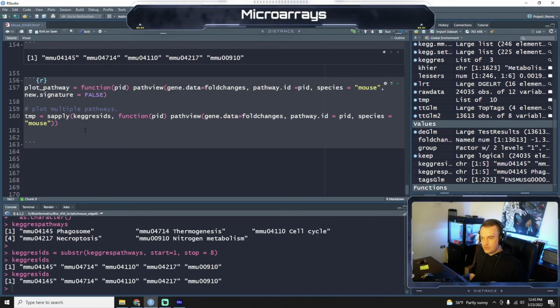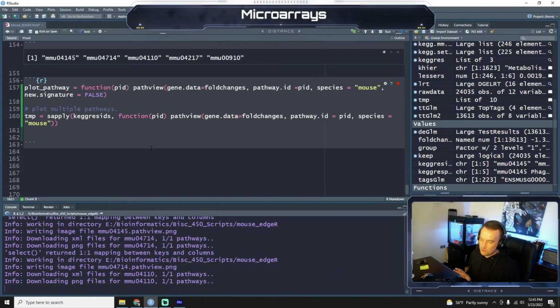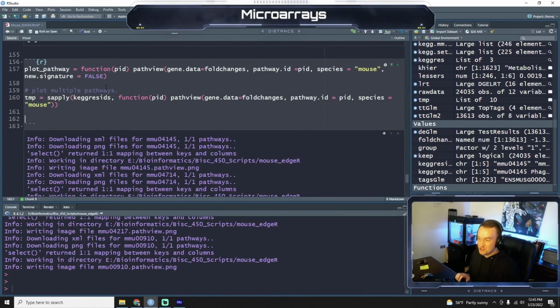Because you're losing your intermittent data. So if I have to go back and look at why this isn't working, that data's gone, it's been overwritten. So just an FYI, it's probably bad practice, but it's a learning lesson. I can tell you why it's bad practice now and show you.